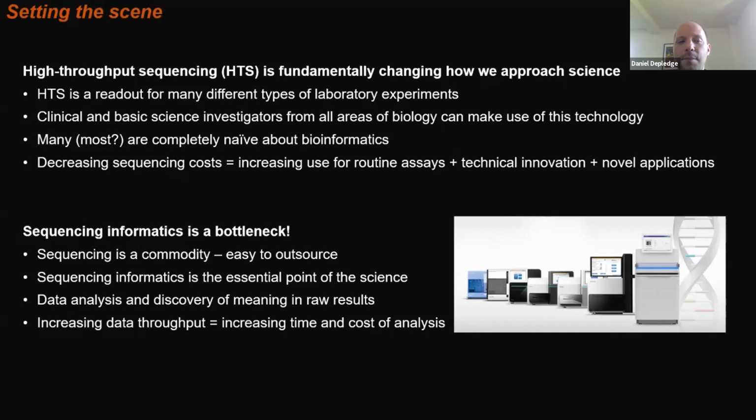One of the big advances in sequencing technology is that more and more samples can be sequenced at ever greater depth. But what that means is the amount of time and the cost of analysis is also going up.